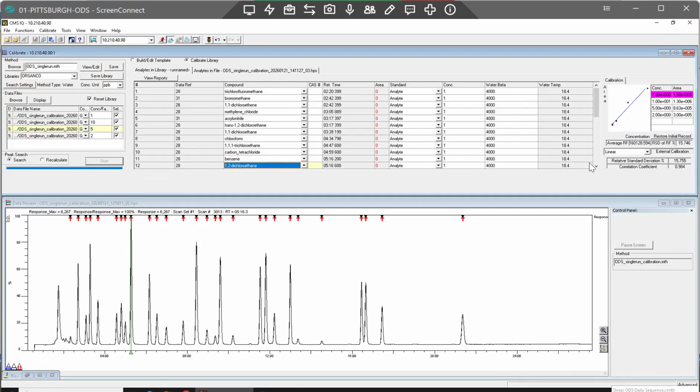Okay, there's another 0.98. Let's see what else we got. 0.995, 0.996. Okay, so really it was just those two outliers. Oh, and I just looked at the SOP and it did say 0.995 is technically the minimum, and then 15% standard deviation, but these are pretty good. I'm not too worried about it if it's two nines, that's pretty good. Oh, that's our internal standard. So yeah, that's going to look different. Although that's kind of all over the place. They should be a lot closer together.